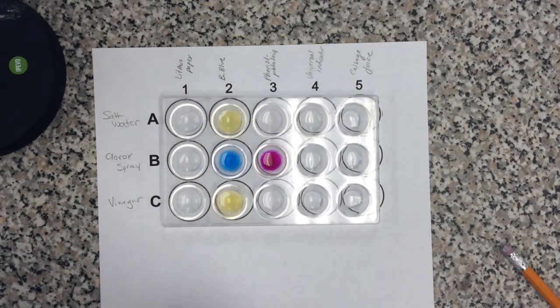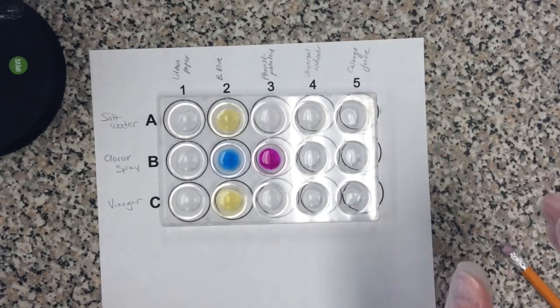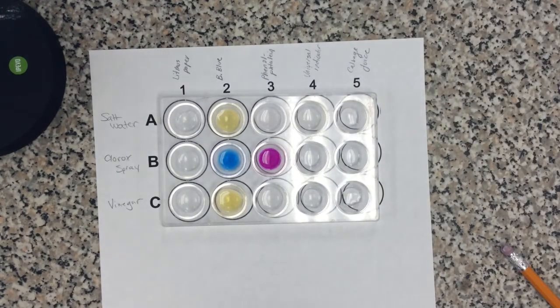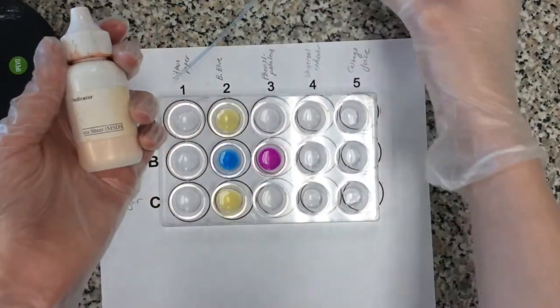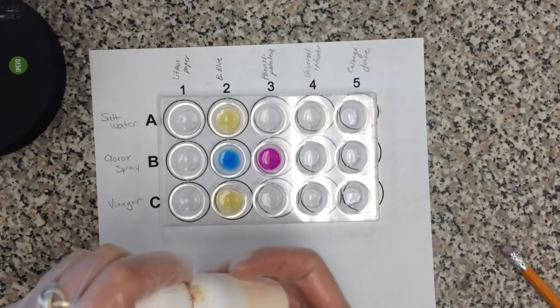All right. So based on these colors and what your indicators are telling you, you can tell that this is either an acid or a base. However, none of the indicators yet have told us how strong of an acid or how strong of a base it is. That is definitely what our last two, our universal indicator and our cabbage juice, are going to help us to do. All right, so our next one is going to be the universal indicator.